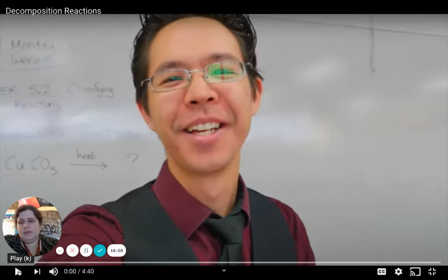So let's look at a decomposition reaction. So this is the decomposition of copper carbonate. So decomposition of copper carbonate using heat.